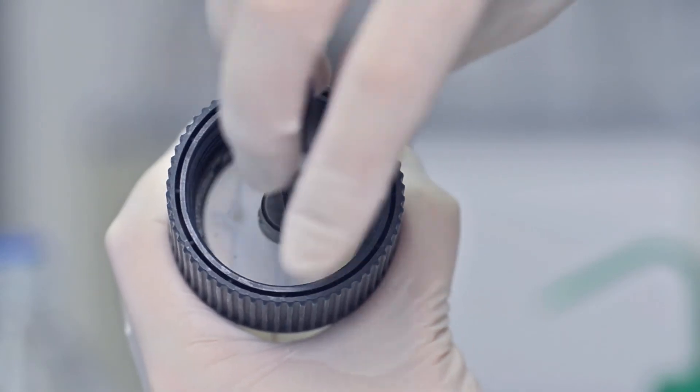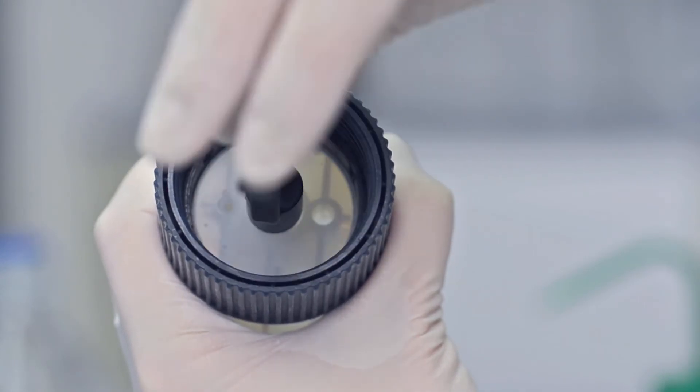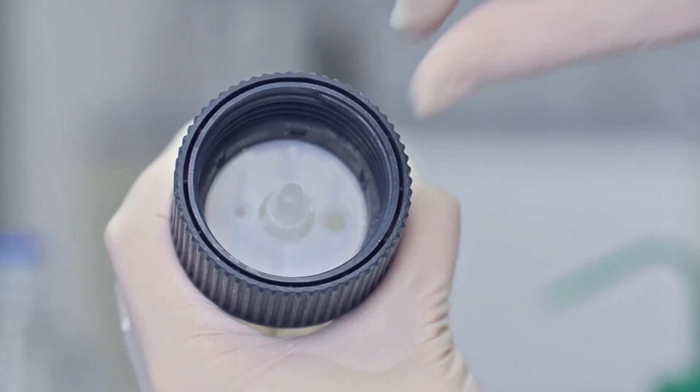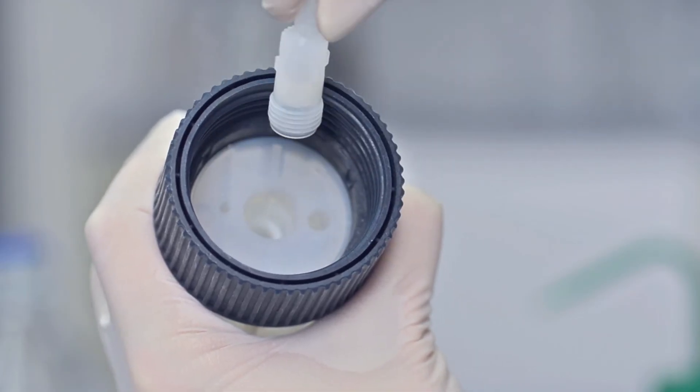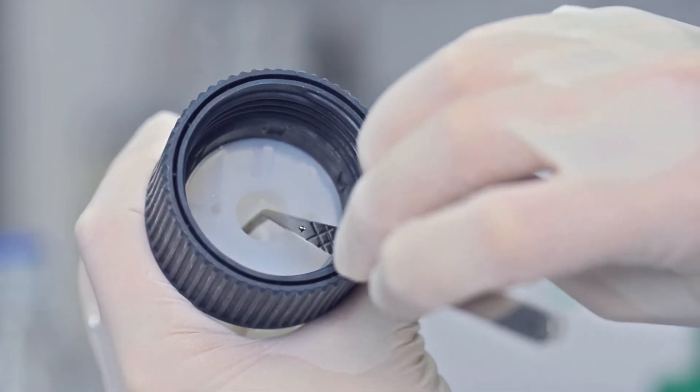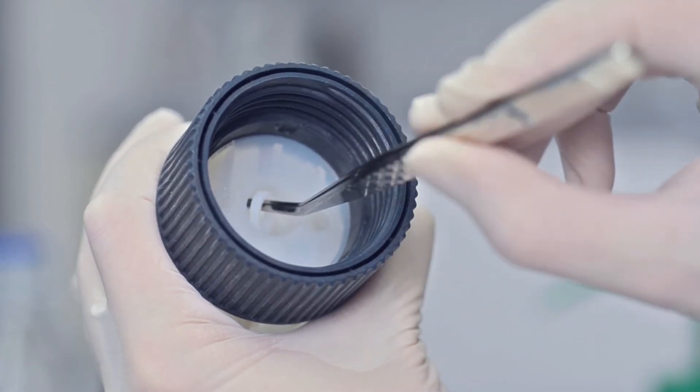Next, unscrew the filling valve with the mounting tool and remove the sealing ring with a pair of curved forceps.